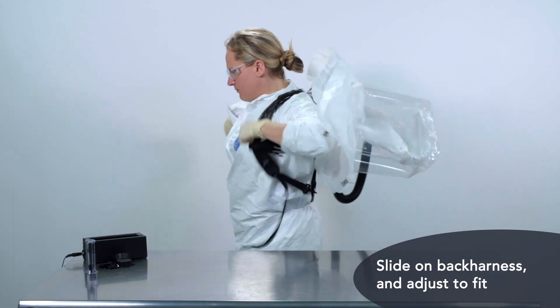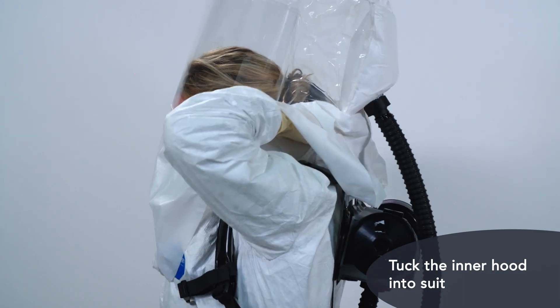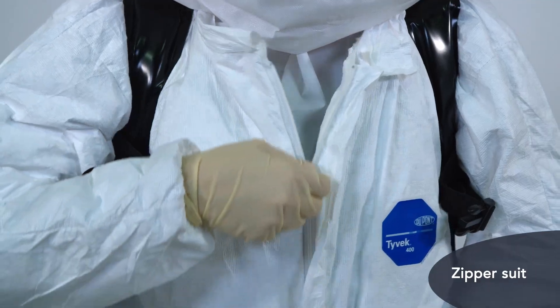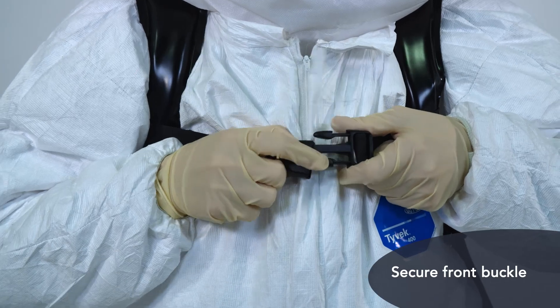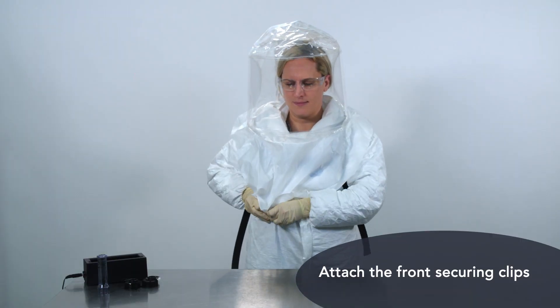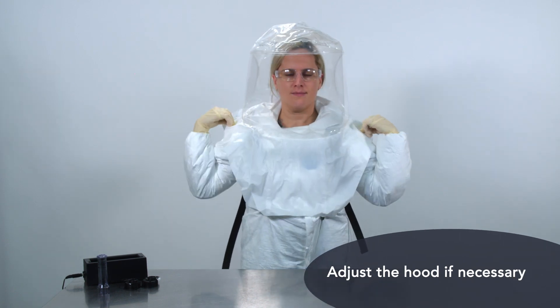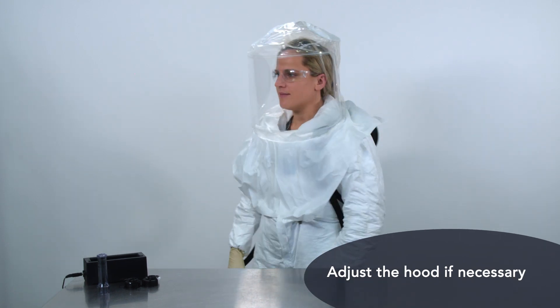Slide on the back harness and pull the Sentinel XT hood over your head. Tuck the inner hood into your suit all the way around your neck. Zipper your suit and secure the front buckle. Attach the bib's front securing clips. Finally, center the hood if needed. You're now protected and ready for action.